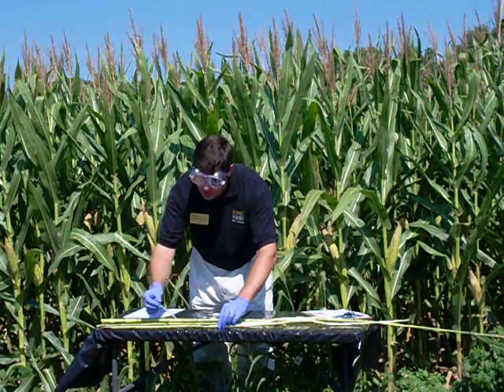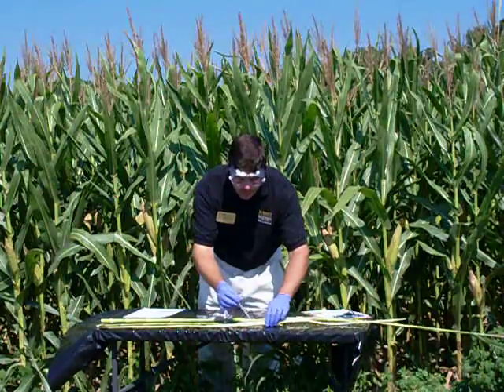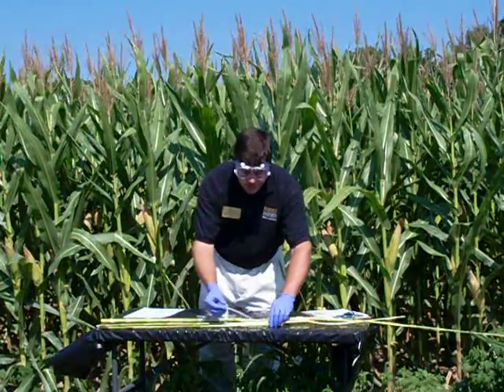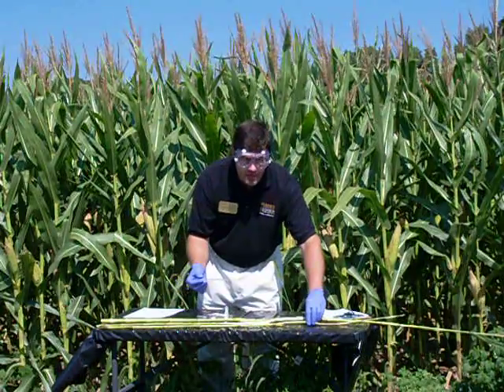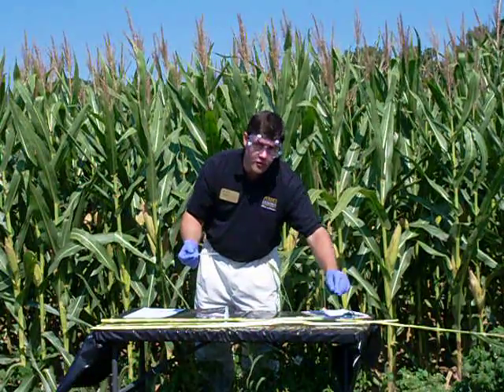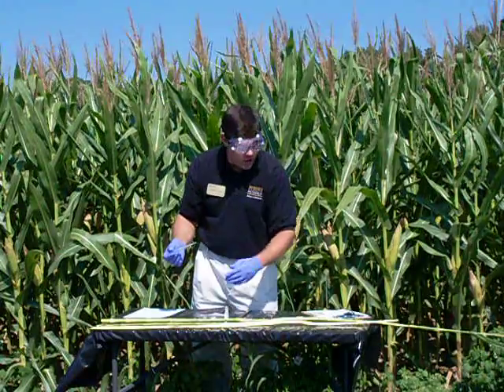A bluish black look to our corn stalks when we're done indicates nitrogen. In most cases, we're going to find it probably in the lower parts. That's where it's going to be the highest concentration at the beginning, where it's being taken up by the plant. And as the nitrate problems become less of a concern, we'll see a lightening in color to almost a yellowish or almost a clear color as we go farther up the stalk, if there is not a problem with nitrate poisoning all the way to the top.